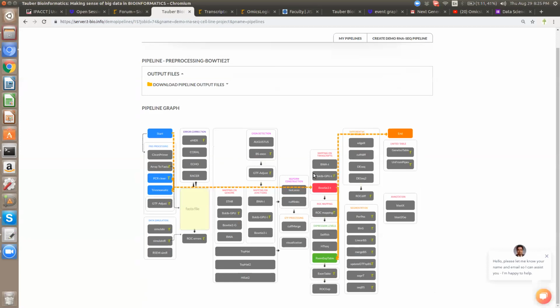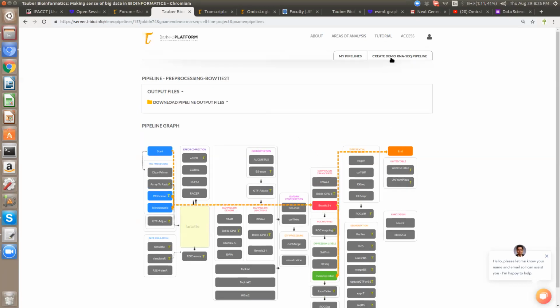Excuse me, one question, please. Yeah, Sunita, yes, please go. Here, is this the only pipeline we can use, like TopHat and this? Do we have HISAT and StringTie, those things also here? Yeah, of course, because as I was telling you, this is a demo pipeline, right? So the input files which are required for our purpose are already uploaded.